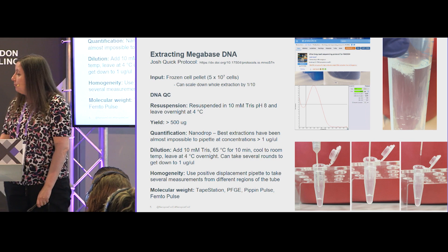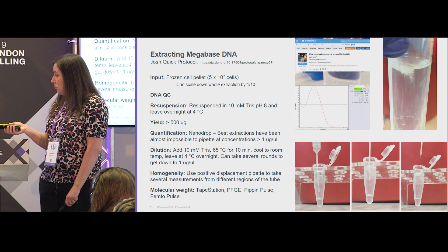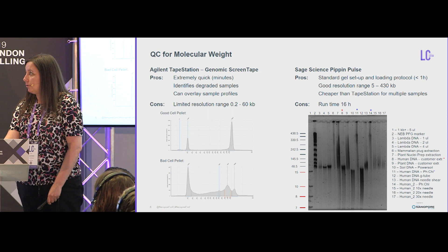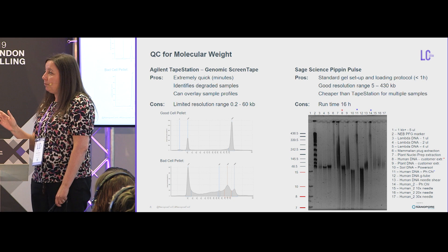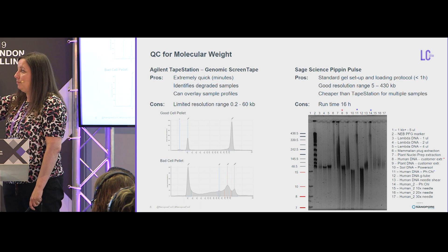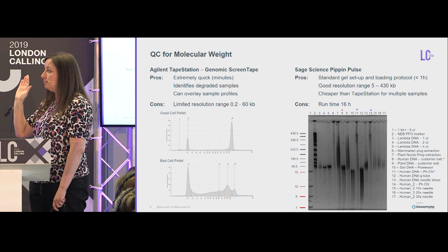Quickly about QC — there are several ways to QC this DNA, the most sensitive being PulseField gel or the FemtoPulse. We have the TapeStation and the Pippin Pulse. The TapeStation is quite good, quite cheap at about £3 per sample, and extremely quick — you get results in minutes. It has limited resolution, but it can very quickly identify terrible samples. For example, one extraction from a bad cell pellet was highly degraded, visible immediately. Generally for high molecular weight DNA, these profiles show everything largely being over 60 kb.